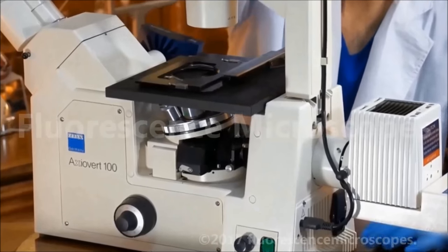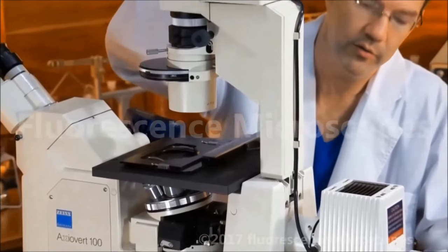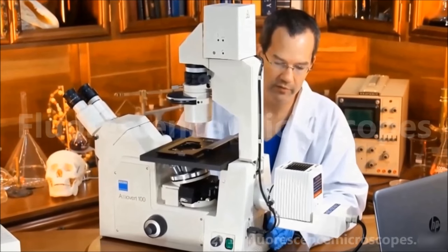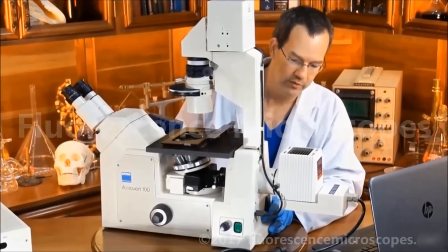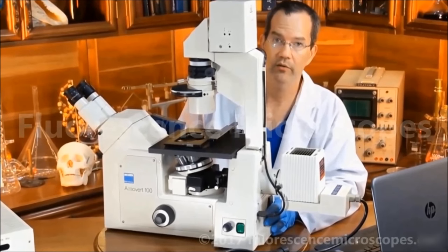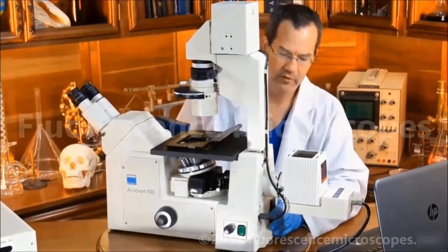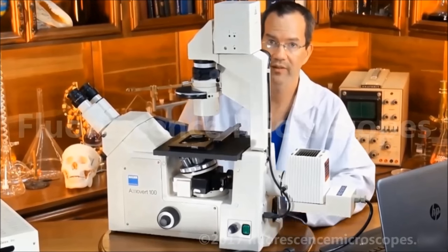The power supply for the 100-watt halogen is located internal to the frame. You can compare that to the Axiovert 35 model, which is a little older model, and it had an external power supply, which was a little cumbersome. You had to make a space for it on the table. This is a much better design.